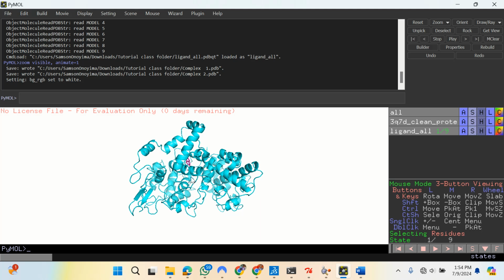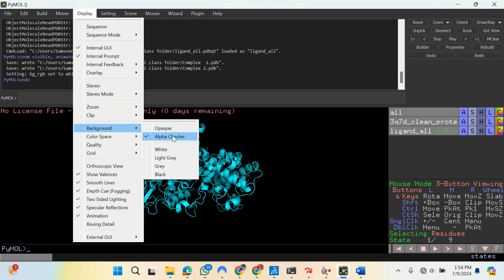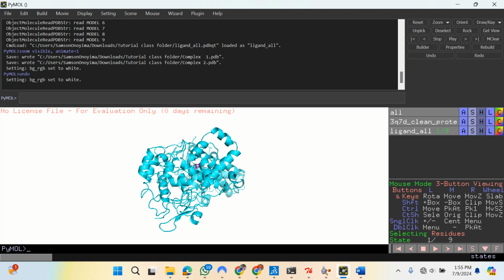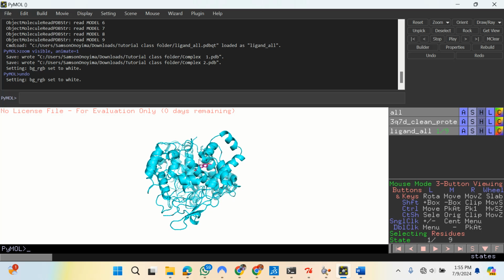So please can you do that? You got how we do it. Just go to display, go to background, go to white. Right? Then I'll click on white. And then this will appear. Okay? So this is what we have.